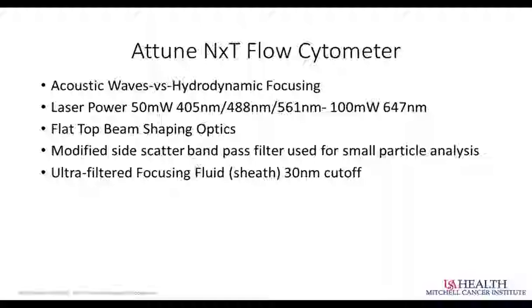I think that we and others in this collaborative effort have come to an agreement that the new bandpass filter really does make a huge difference. And as I mentioned before on the previous slide, the ultrafiltering of the focusing fluid really does dramatically decrease the background noise that we see in running samples.